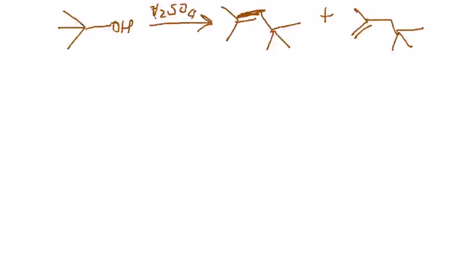The upcoming lab is dimerization of an alkene. You can call it synthesis of isooctane starting with T-butanol. The reaction, in a sense, is very similar to what you did last semester, where you learned about the elimination reaction of what happens when you treat a tertiary alcohol with an acid and heat it up.